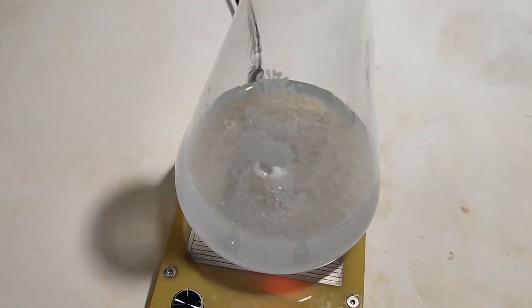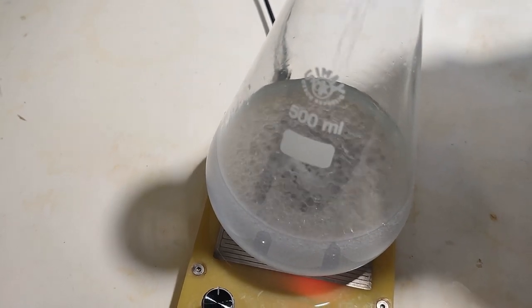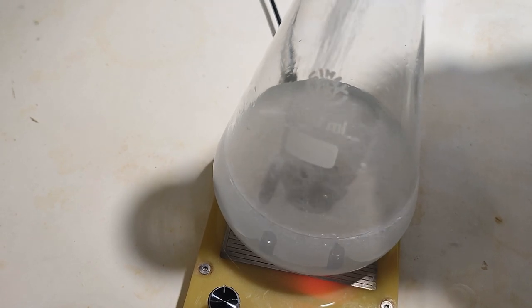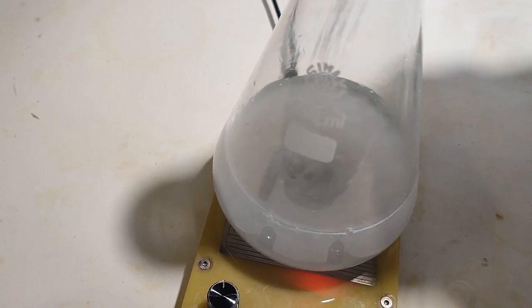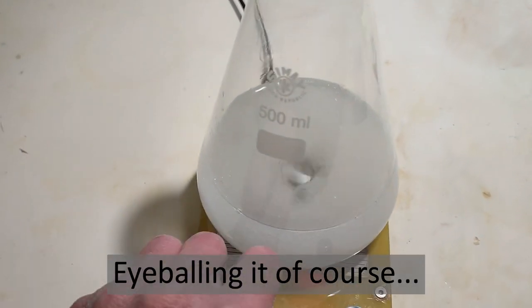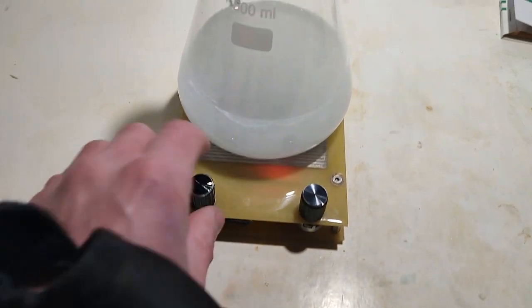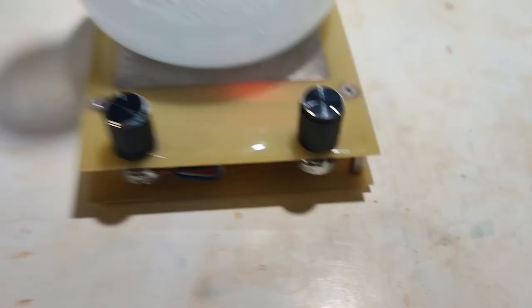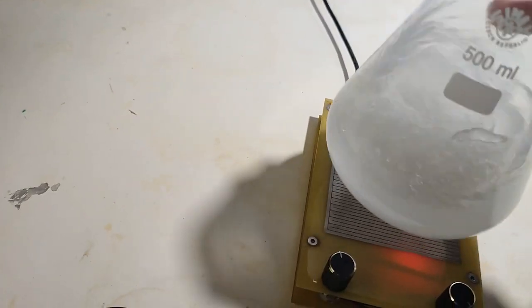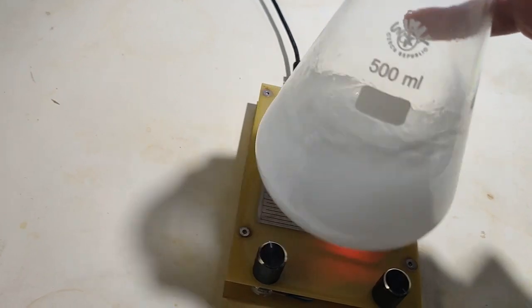I will add like, look how much I will add. That's 35 grams. And now mix. And I lost the stir bar. Jesus. Okay, I will stir it by hand then.